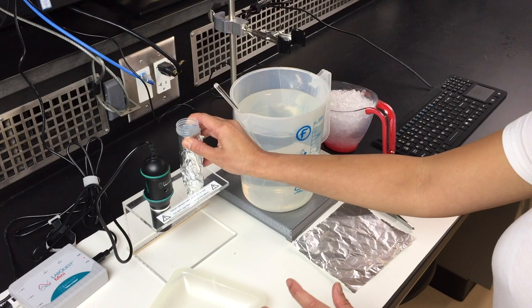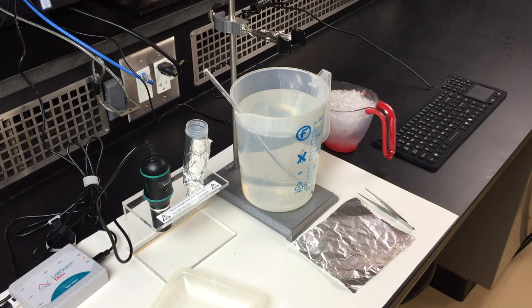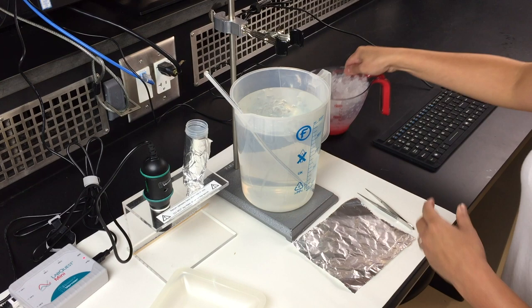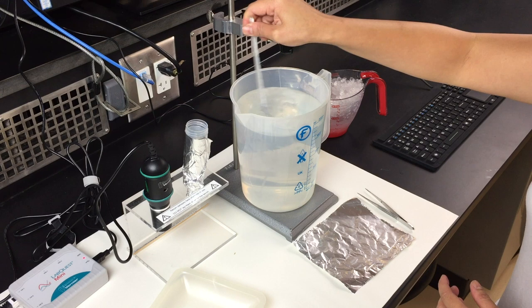For the first temperature, it will be at 20 degrees. Get the tap water to fill in about 1.5 liters in your jug for the water bath. Add some ice into your water bath to bring the temperature down to 20 degrees.